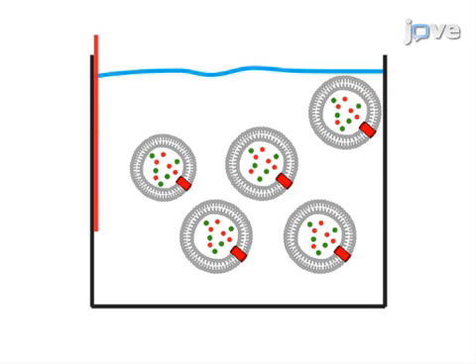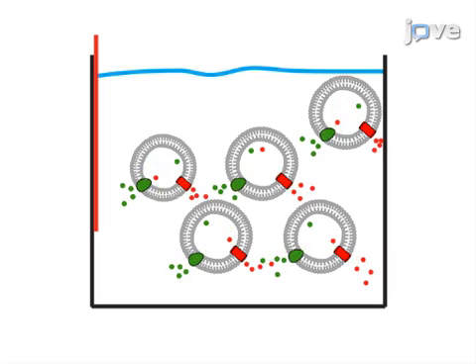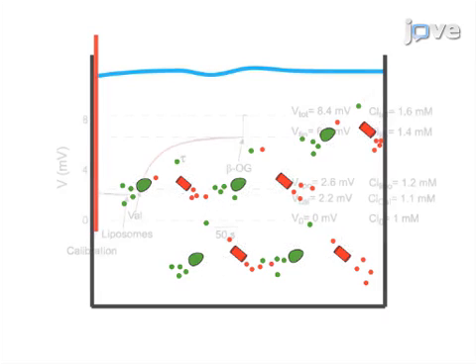Next, chloride efflux from the liposomes is initiated by addition of valinomycin, a potassium ionophore which relieves the membrane potential. Once the signal reaches steady state, the experiment is terminated by the addition of detergent to dissolve the liposomes.